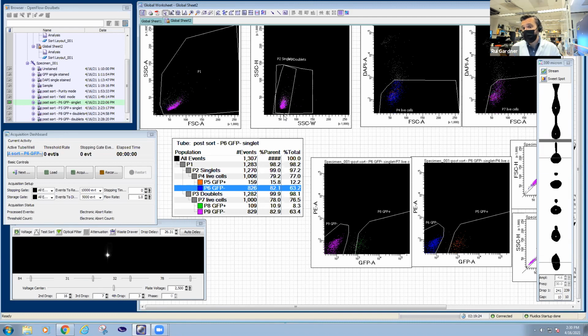And I suspect, and this is one of the difficulties with this sample, and one of the reasons why we wanted to show you this, it would have been nice to show pictures of how this sample looks under the microscope, but you may want to be really restrictive to make sure that you eliminate all of the doublets.